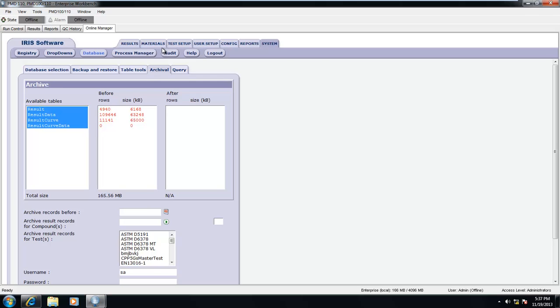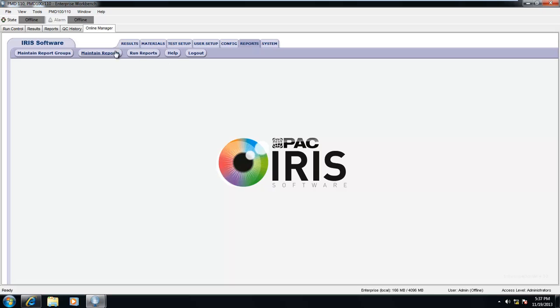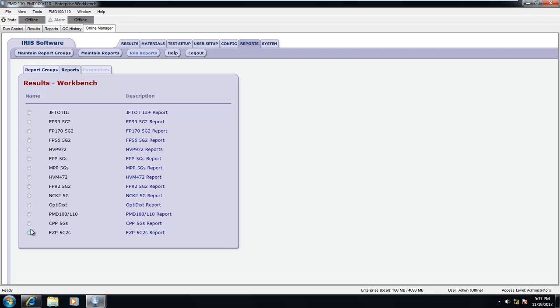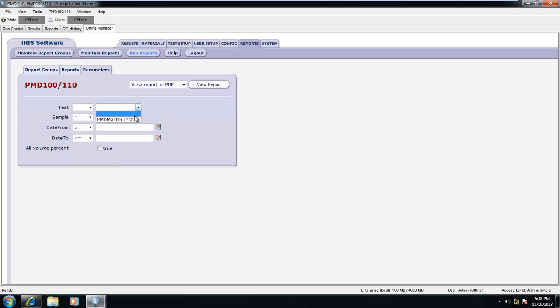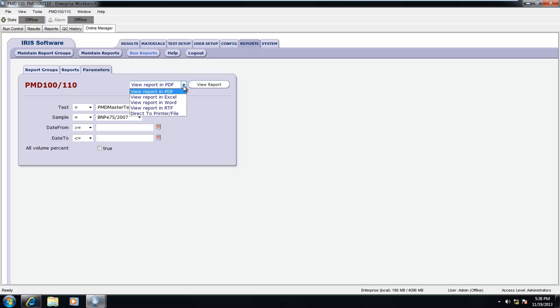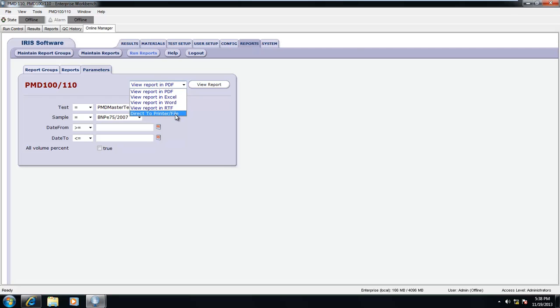As with any system, good database practices will maintain system efficiency and integrity. When viewing results in the workbench, we are only allowed to view one result per report. In the online manager, we are allowed to view multiple results per report. By selecting Run Reports and selecting the workbench, we can choose our desired instrument. Using the provided filters, we can select our criteria for the report. Once our filter criteria has been provided, we can choose to export our report in PDF format, Excel, Word document, rich text file, or print directly to a printer.